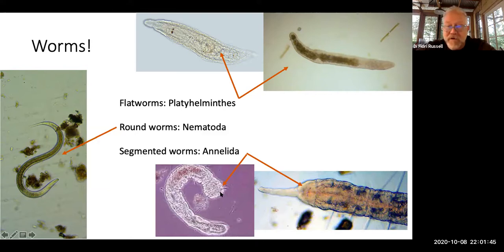The segmented worms down here below, you might be like, wow, these kind of look the same, except the segmented worm, you can see repeating segments. Even on this one here that's not very distinct, that's in the purple, you can still see these delineations for segments.